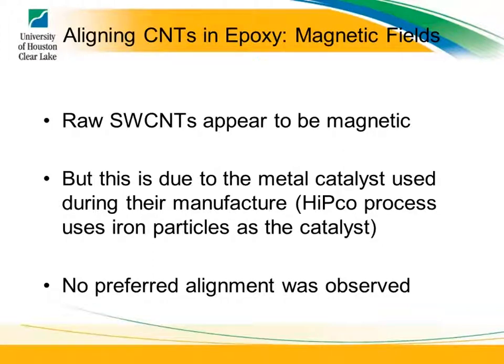There's other methods of growing nanotubes. Molybdenum is used. Cobalt is used. So there's different processes, and everybody has their own patents on how to make nanotubes. Some people think they have a new patent, so they bring their samples to the lab at Rice, and they tell them, sorry, there's no nanotubes in there. At least they're not single-walled. But inside here, there's iron particles. During this high sonication process, a lot of those particles will break off because you're breaking the nanotubes at the end.